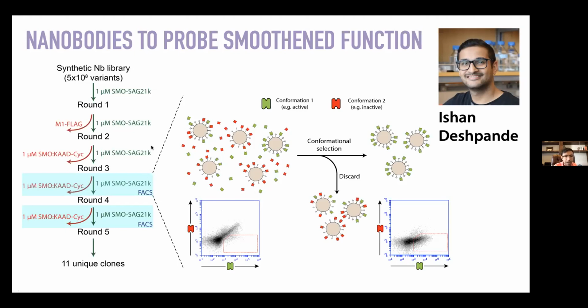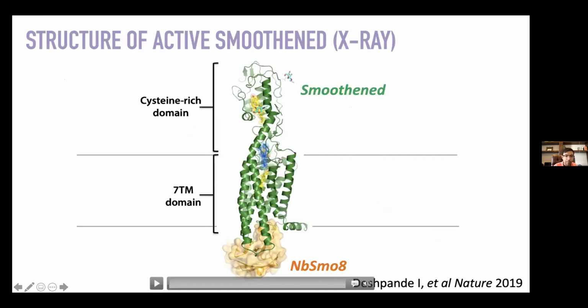So he identified a number of clones, which we've subsequently characterized. The first one, and this was when we were far more adept at crystallography than cryo-EM, we were able to get a structure of with X-ray crystallography. And this structure actually revealed quite a bit about how this pathway, how this receptor turns on. And it's published work, so I won't spend a ton of time on it.